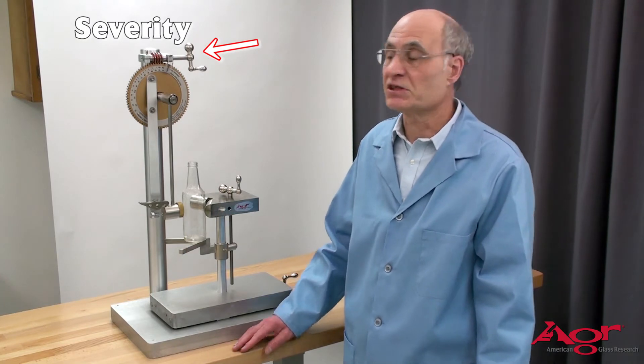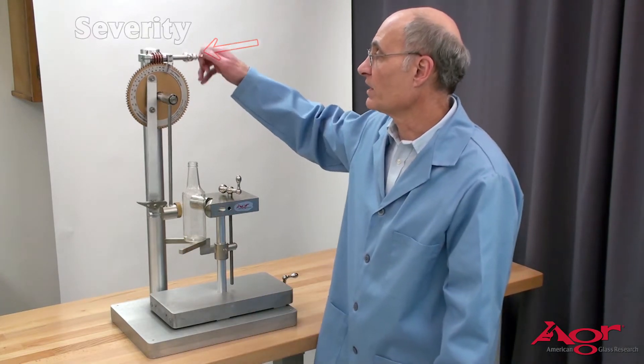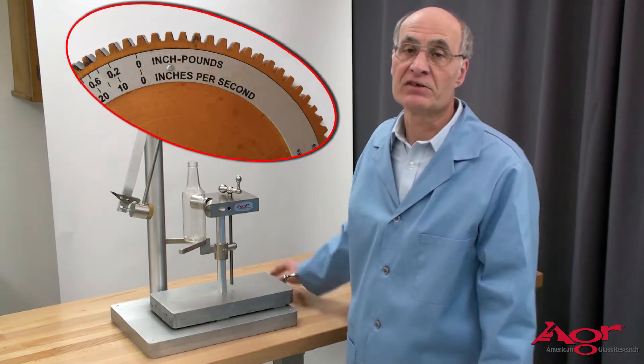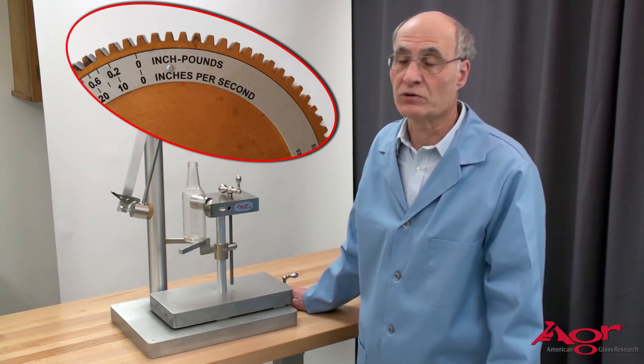The severity of the impact is judged by how far you crank the handle back. The scale is either in inches per second or energy units however you want to do it.